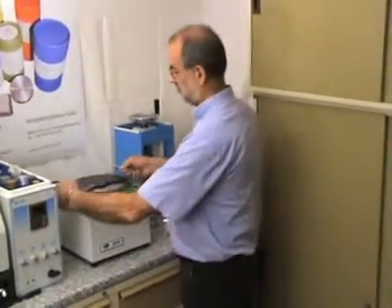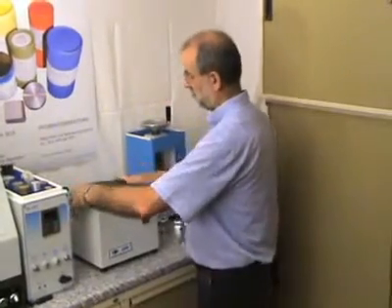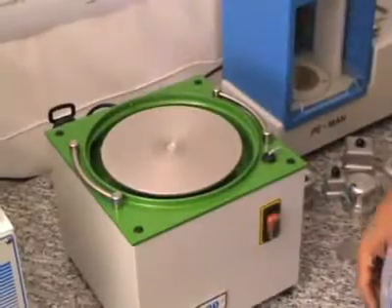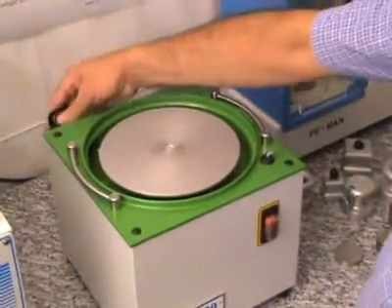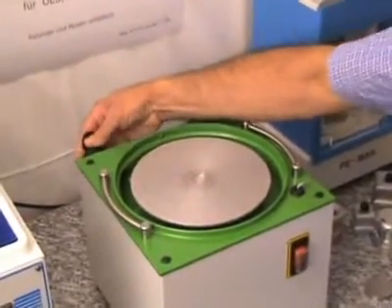This is a small portable dish grinding machine with two handles, weighing approximately 22 kilograms. When taking off the cover, you see the tray for collecting the grinding dust. A dust exhaust connector is installed at the back.